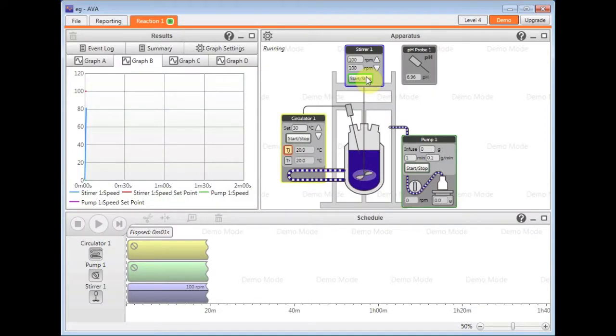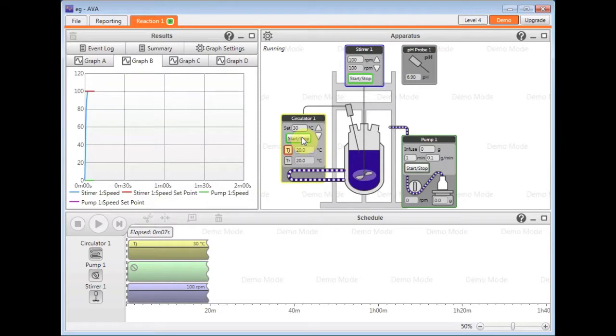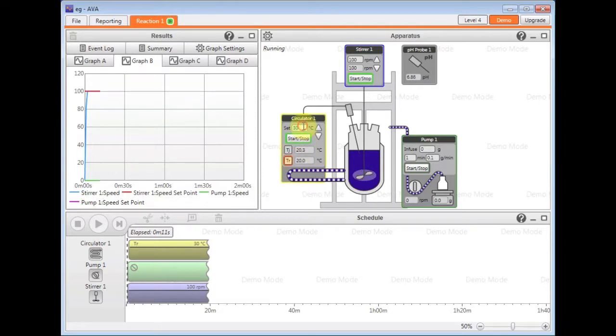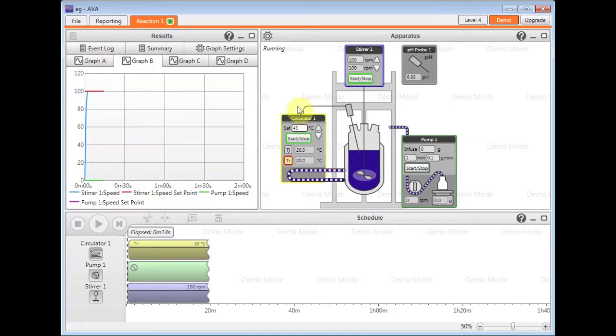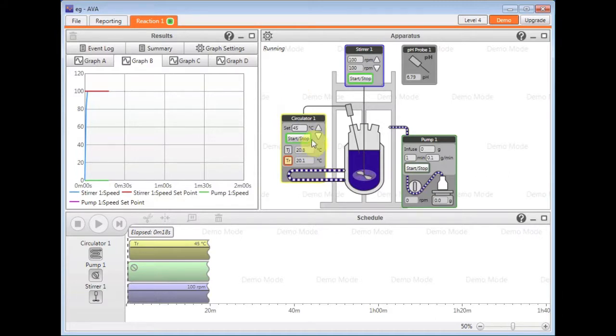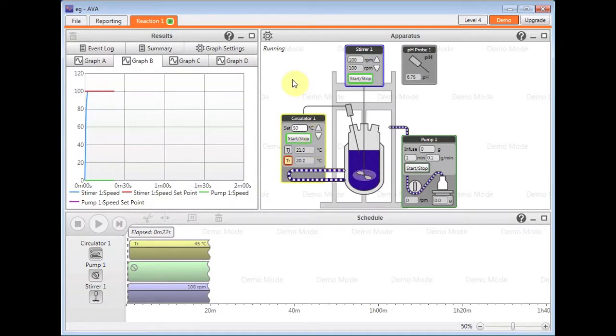Control the stirrer has started. I also wish to start the circulator and switch to reaction control. And let's say in this example, actually increase the value to 45 degrees, which I can do so by clicking in the box and typing a new value, or using the up and down arrows to increase accordingly.